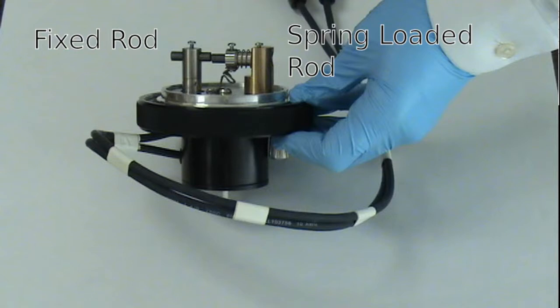The carbon rod head has two posts, one with a fixed rod and the second with a spring-loaded rod. The fixed rod will only need to be replaced when the flat is compromised.